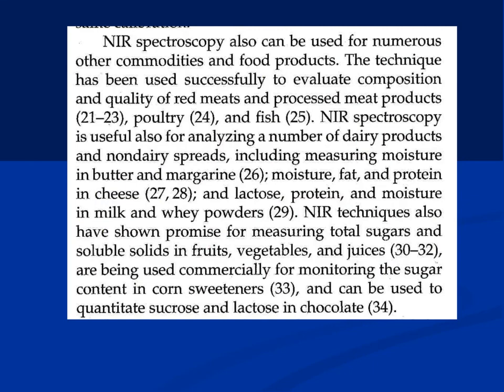So NIR is non-destructive. It interacts with the vibrations of the molecules, and on that basis we have designed these instruments to detect all these different components of food in a mixture of food. That's the good thing about it. So that is it.